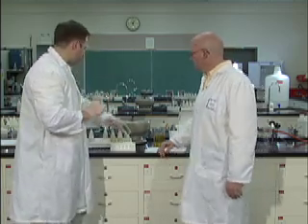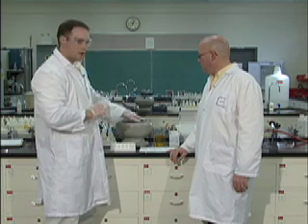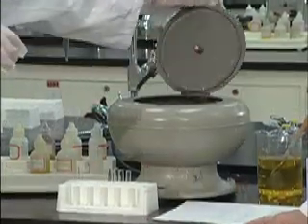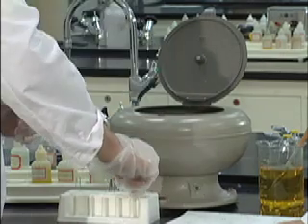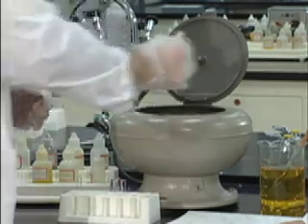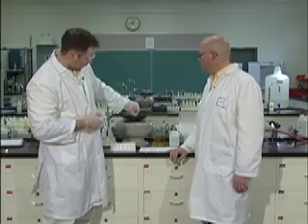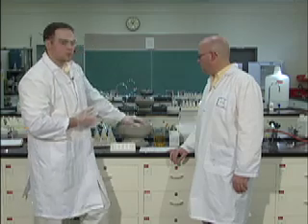Now, your centrifuge is this large round thing that sits in the middle of your bench. Now, these have been known to walk off the benches before. They walk off the benches by themselves, exactly. So what you want to do, on either side, you're going to put these tubes into the centrifuge, but you need to balance the centrifuge. So just make sure you have a tube on either side. Actually, it works best if you work with a partner. And what you're going to do is turn on the centrifuge, and we're going to wait for about 30 seconds.